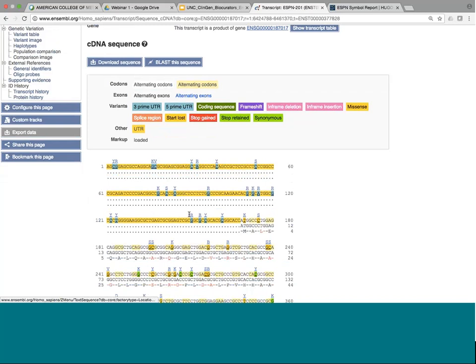And again, as you rightly pointed out, you can click on a lot of these, as I'm doing now. You can find out information about the different alleles, and you can jump straight to the variant tab, for example. We're going to do this in the next webinar, but you're exactly right. You can jump from this view to find out more information about more specific features as well.